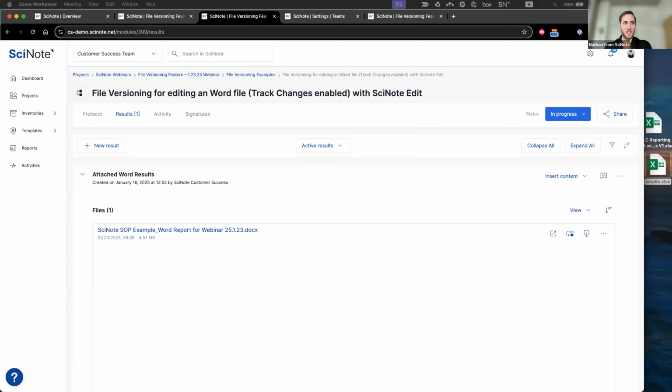Perfect. So I'm going to share my screen as well. Everyone, please let me know if you're seeing it okay. Also, if it's appearing large enough, I can zoom in slightly to make it a little bit easier.